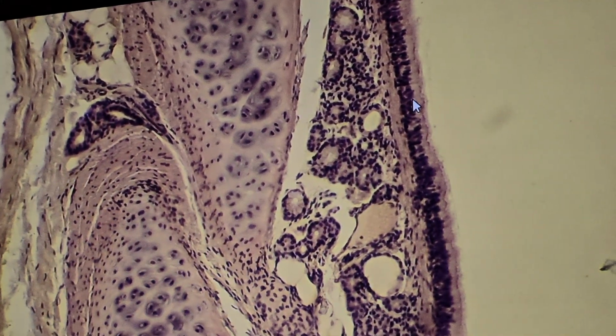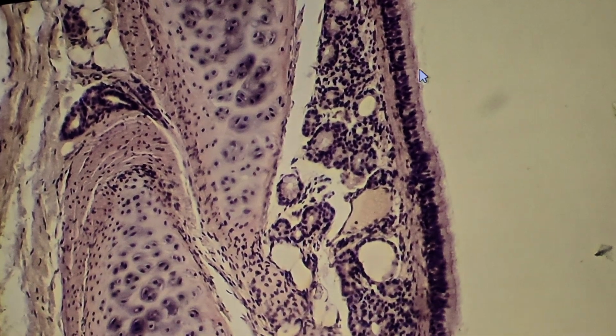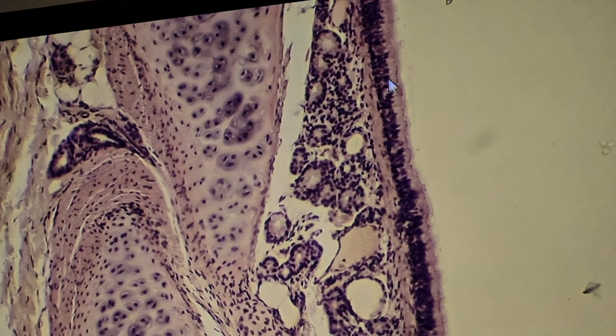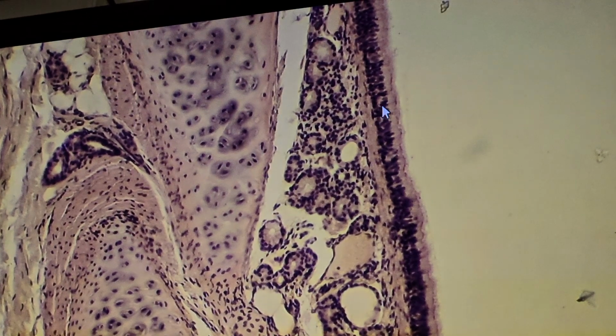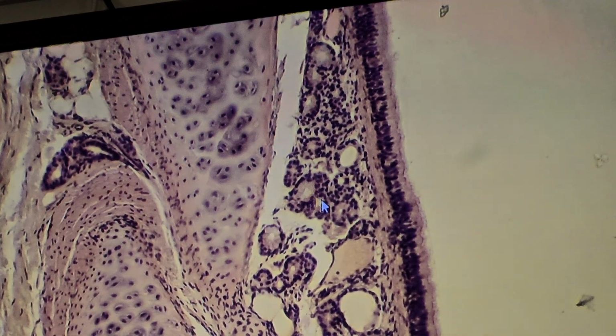Respiratory epithelium, 5 types of cells. You can see the cilia, pseudostratified columnar epithelium. Beneath the epithelium, we can see lamina propria with seromucous glands.